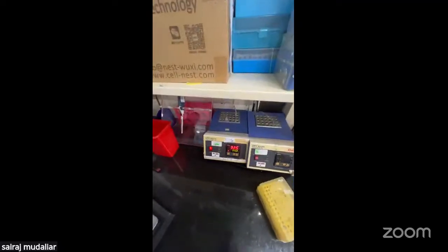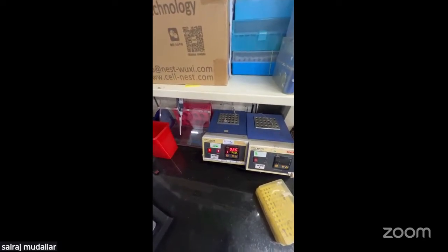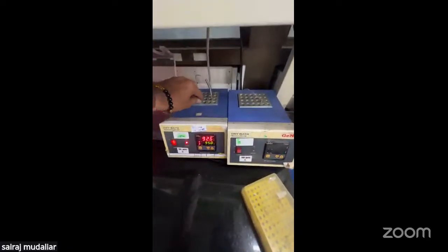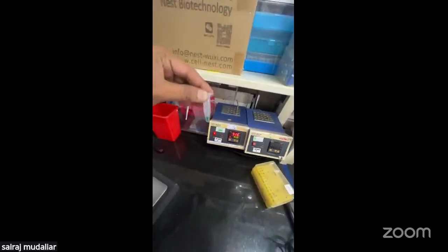So basically the lysis, the first step, consists of the reduction and the alkylation. The lysis buffer itself has the reagents equivalent to TCEP as well as the alkylating agent like iodoacetamide, which does the reduction as well as the alkylation. After 10 minutes we take out the samples.